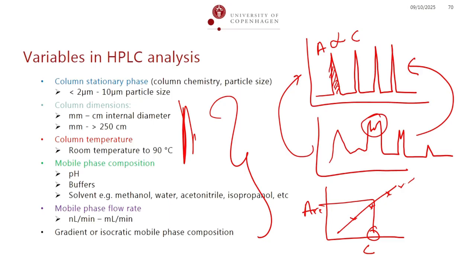You can quantify how much protein is present. You can quantify how much amino acid is present using the right type of chromatography. Does that make sense? So, the peak area varies depending on the concentration of the analyte. Please note that I'm only showing the basics of chromatography considering the students here, but if you need advanced knowledge, please come and talk to me later, okay?